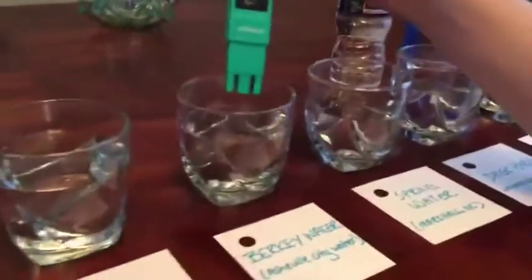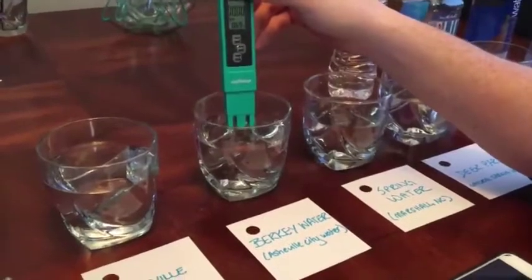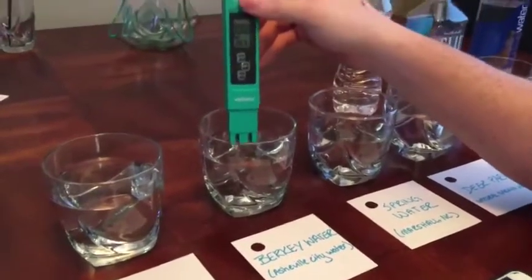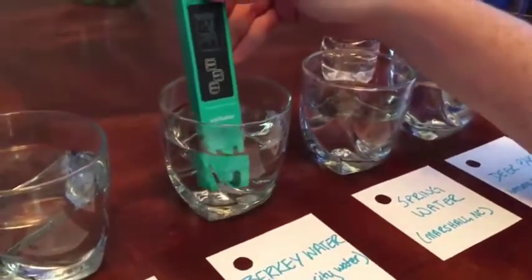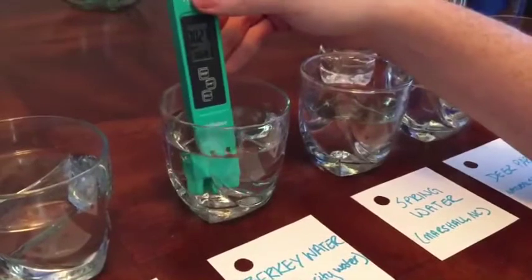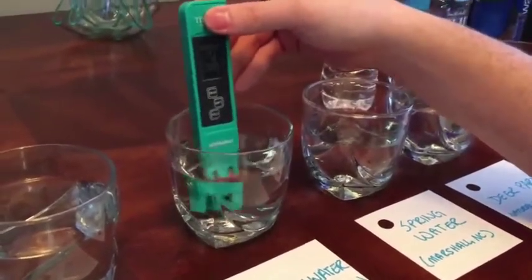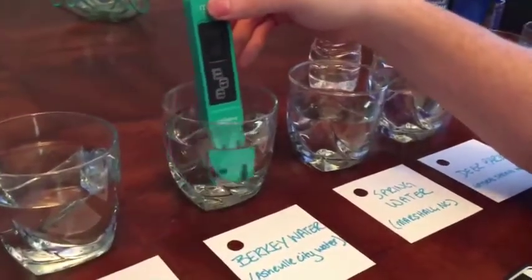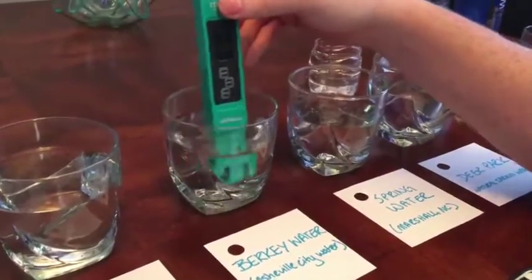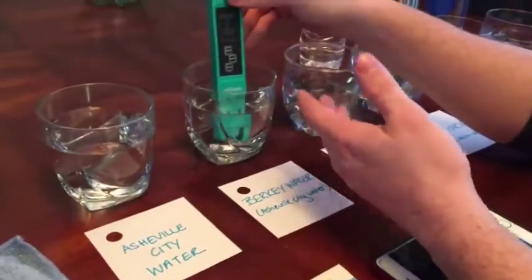Now let's test the Berkey water — this is a charcoal gravity-feed filter using Asheville city water. The Berkey is pretty expensive, and it's only knocked the reading down by about three parts per million. So it's probably mainly managing to hide the smell and taste of the chemicals rather than removing dissolved solids — you may want to reconsider it.